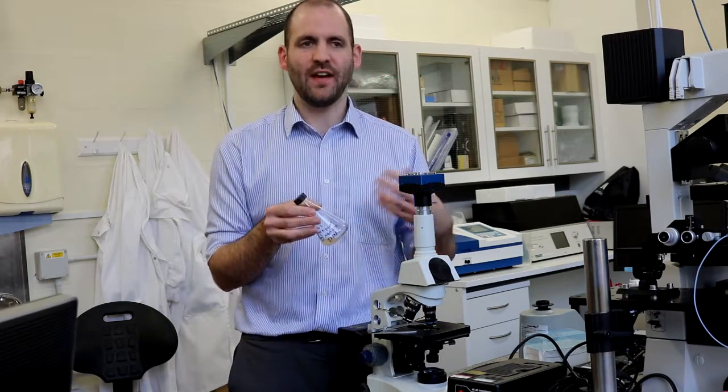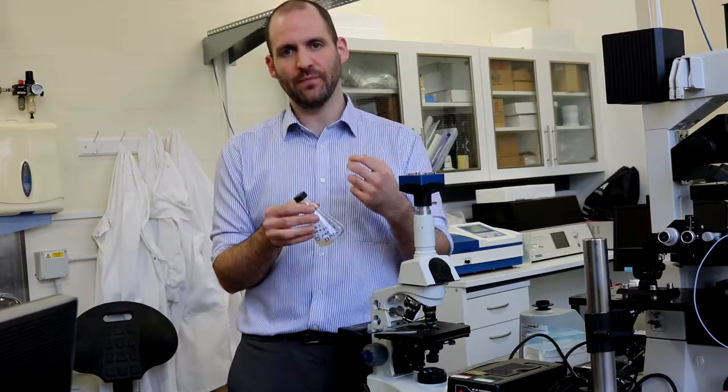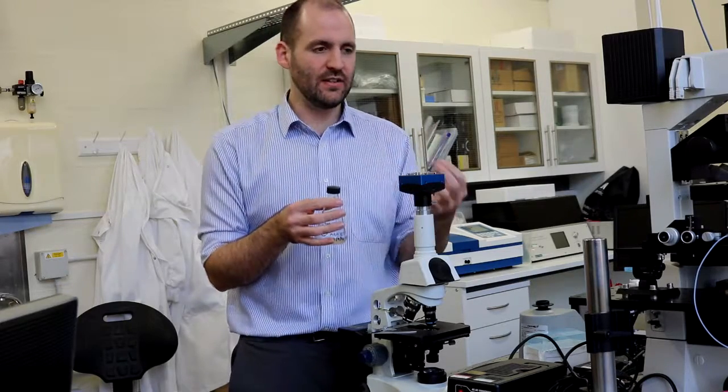Archaea that live in the Great Salt Lake in Utah have evolved defense mechanisms against harsh UV illumination. And one of these is to develop proteins that shield them and that can absorb some of the energy and somehow defray the energy that's coming in and stop it from blowing their DNA apart and everything else. So the different cells often are very colourful because the proteins that come out inside them have to interact with light in some way, and that's kind of what we see with our eyes. We see a lot of different coloured cells in this.